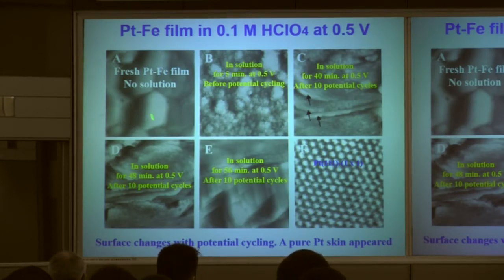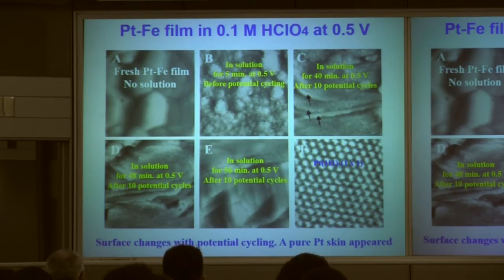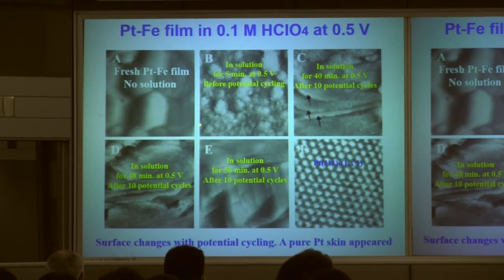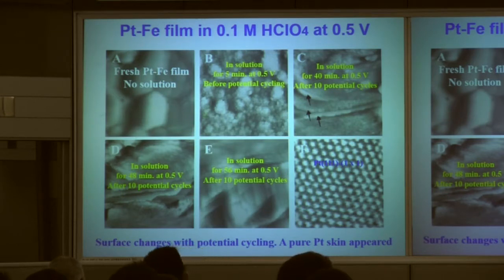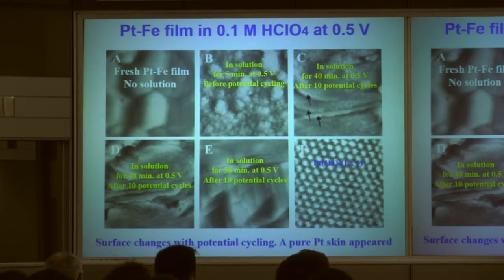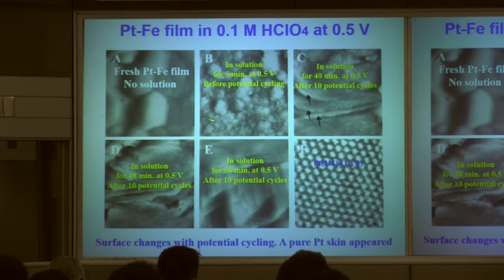Here is the STM observation result. First, we have a fresh platinum-iron film prepared by PVD. After preparation, we placed the film in an electrochemical cell. Without any electrolyte solution, the surface looks like this. After adding perchloric acid electrolyte to the cell, very quickly — immediately — we found the surface became very rough.